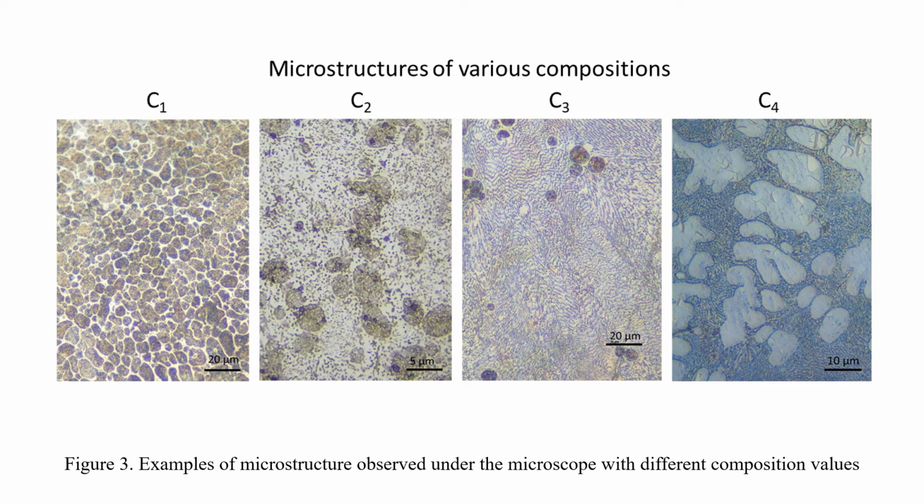In addition, the quality of the polishing and etching also determines how representative the observed image is of the actual microstructure of the alloy.